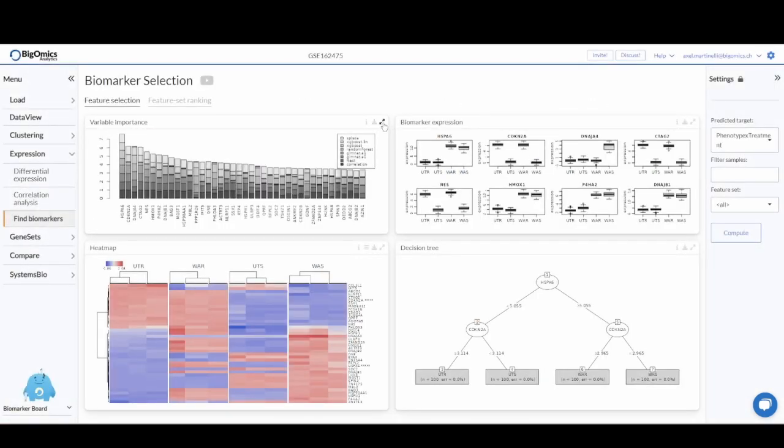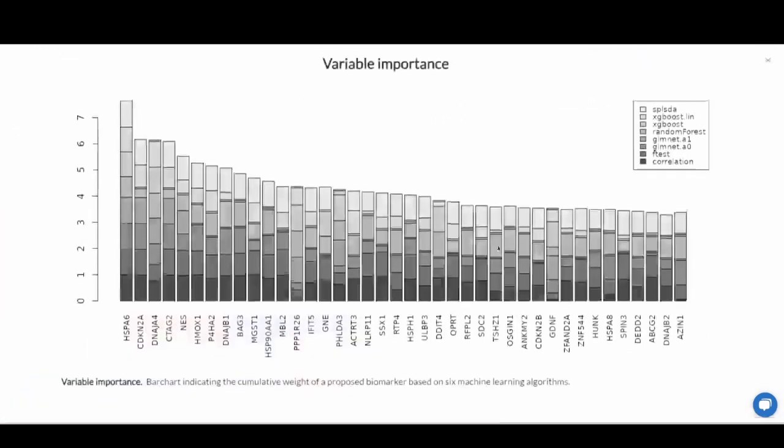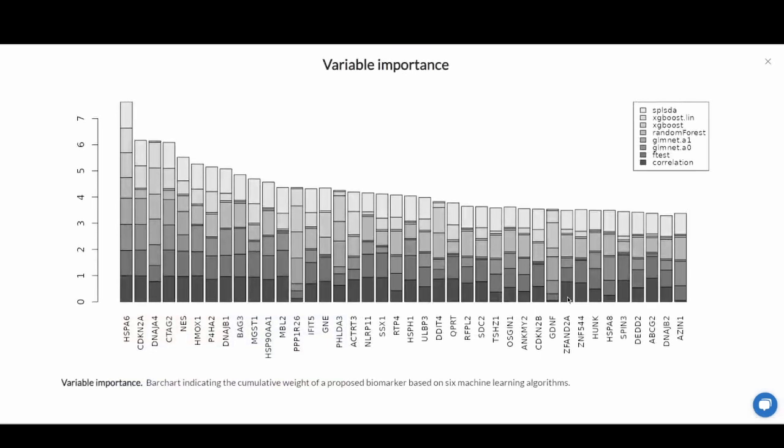Finally, we have the variable importance plot, which is the most important from a bioinformatics point of view. This is based on combining the results of six different machine learning algorithms as well as two other statistical tests.